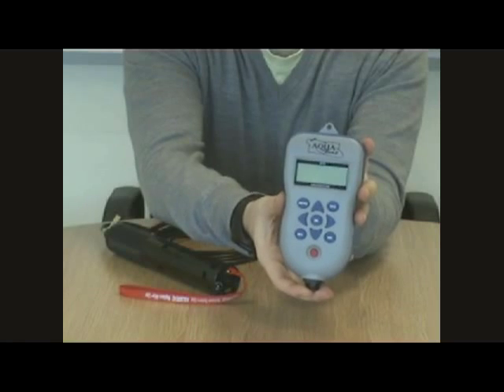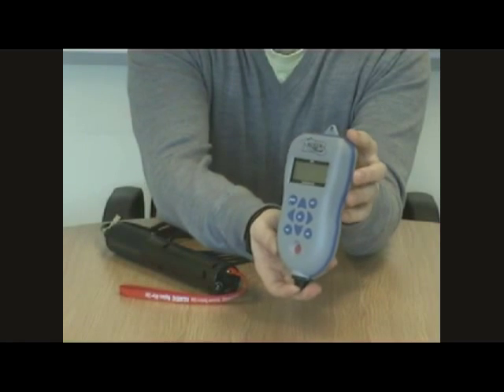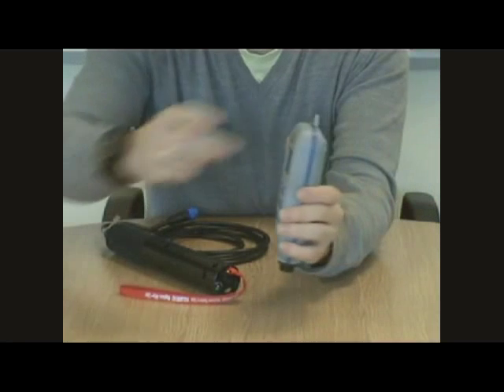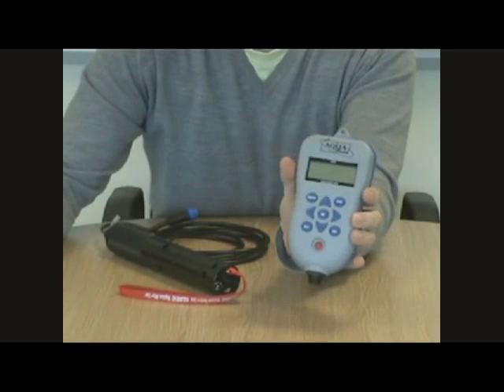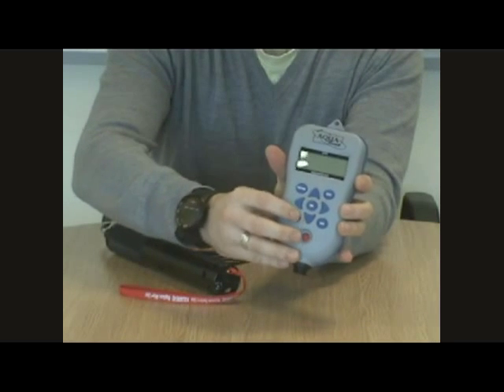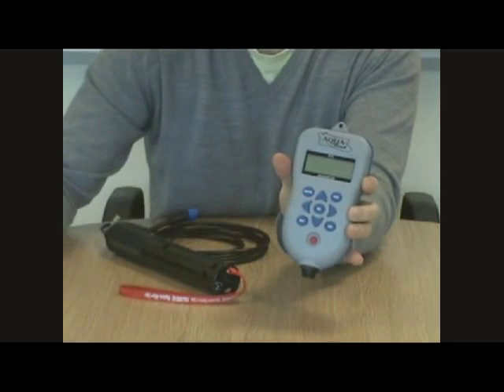So here it is, the GPS Aquameter from Aquaread. As you can see, it has a nice curvy design which fits very nicely in the hand. The blue rubber gasket will also help keep it in your hand even in wet conditions. The colour of that blue gasket is mirrored in the keypad which has a nice reassuring click with every button press.